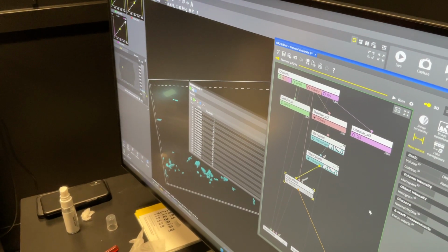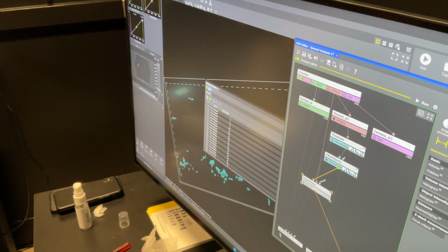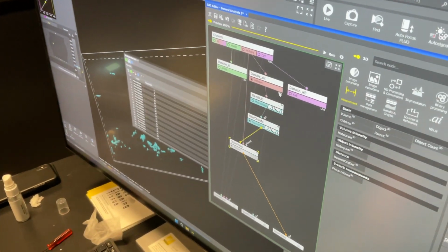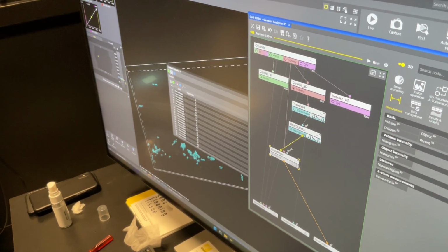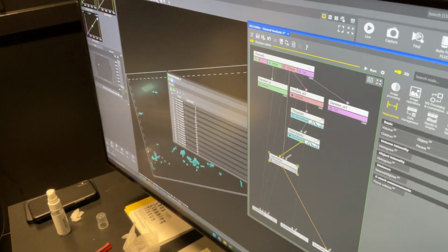When it says save pictures, is it saving like...? So basically, if these are linked to the denoise.ai, when this works on the image, you'll get the denoise.ai image, like you were running it on your picture. If I instead connect these to the raw data, it's going to do this, measure, and then discard these changes to the image.